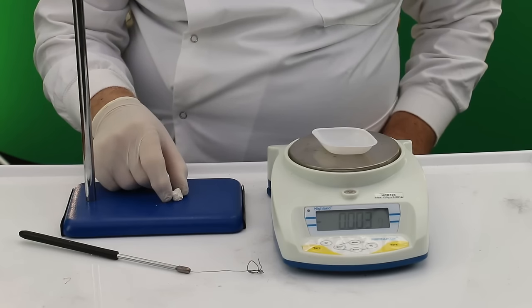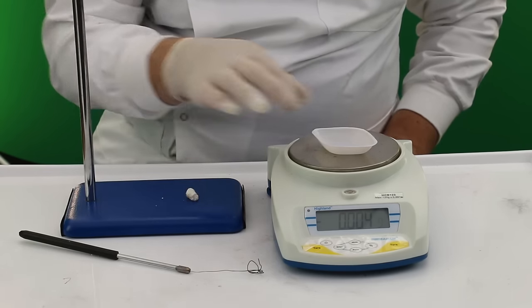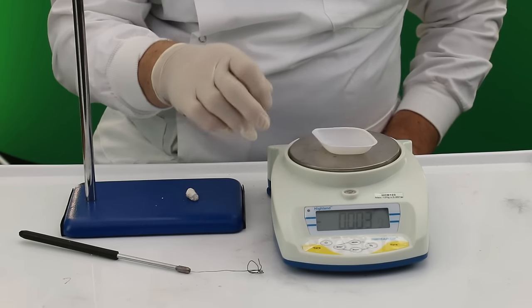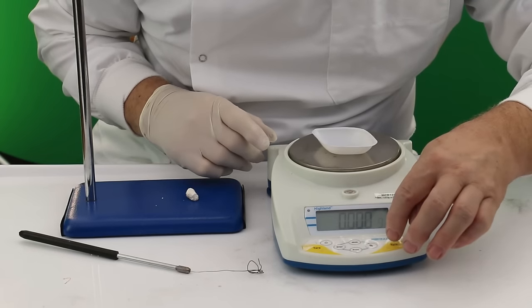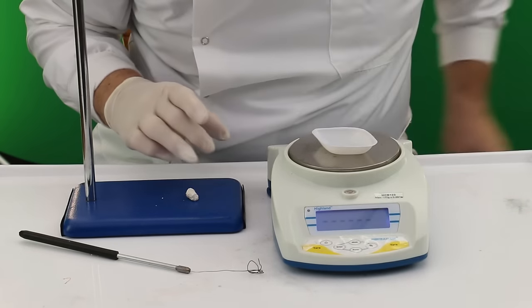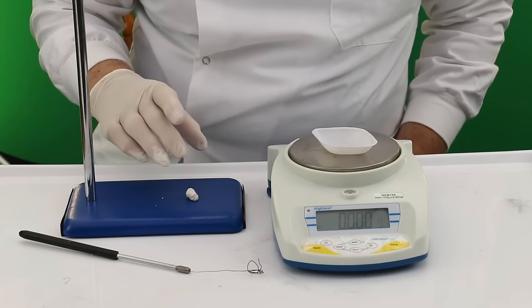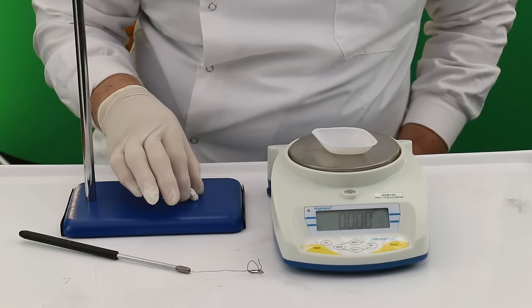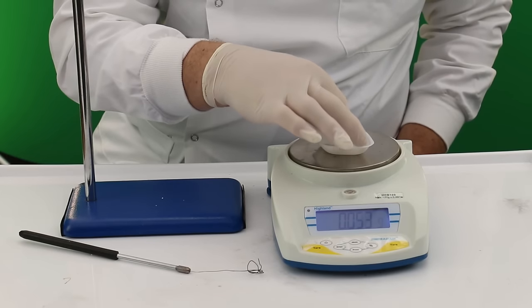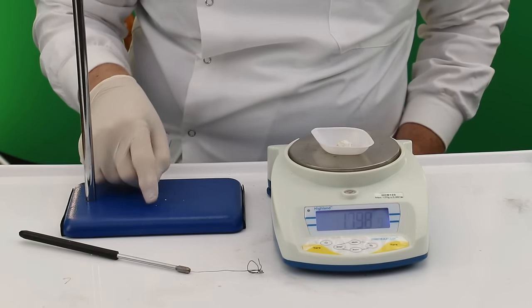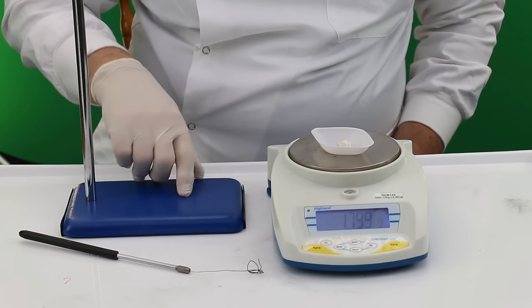Now we've allowed this to cool, we're going to place this in a weighing boat on the balance. So the first thing I need to do is ensure the balance is zeroed. And once the balance is zeroed, I can then put on the piece of calcium oxide to see what weight difference we've got.